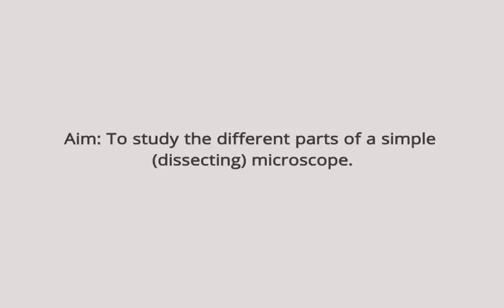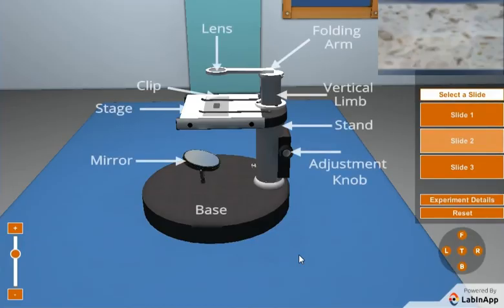We aim to study the different parts of a simple dissecting microscope. The different parts of a simple microscope shown are: lens, folding arm, vertical limb, clip, stage, adjustment knob, stand, mirror, and base.